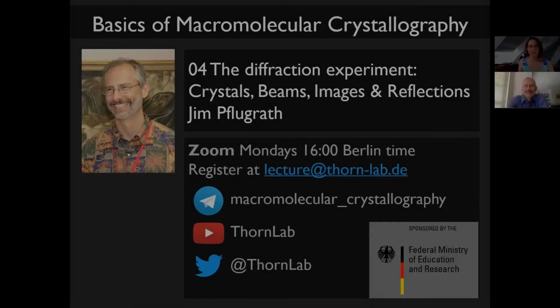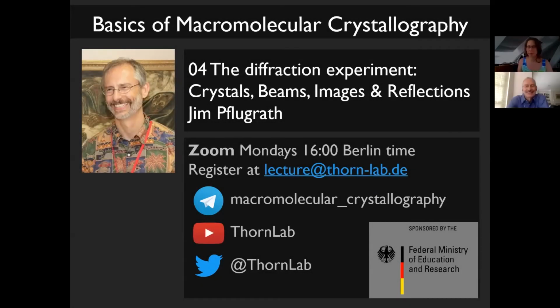All right, good afternoon or good morning, depending where you are, to what is technically, after having two parts of history, our fourth lecture in the basics of macromolecular crystallography. Today, Jim Pflugrath is going to tell us about the diffraction experiment, crystals, beams, images, and reflections, followed by a second lecture by him next week, which will more deal with scaling and statistics.